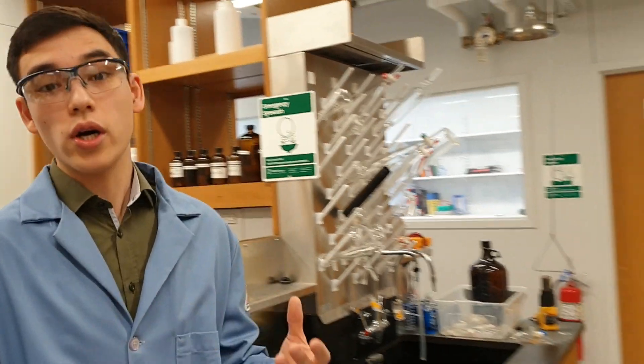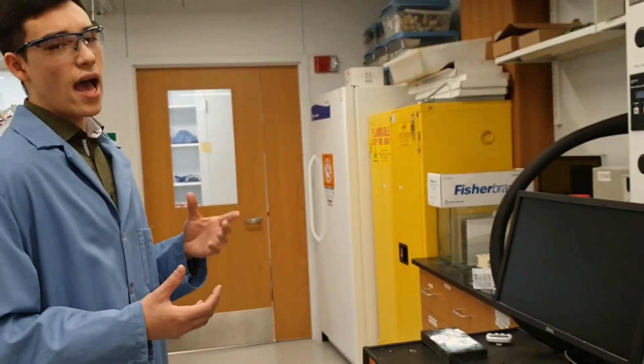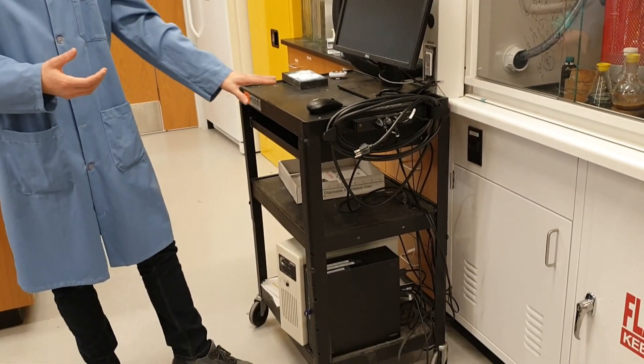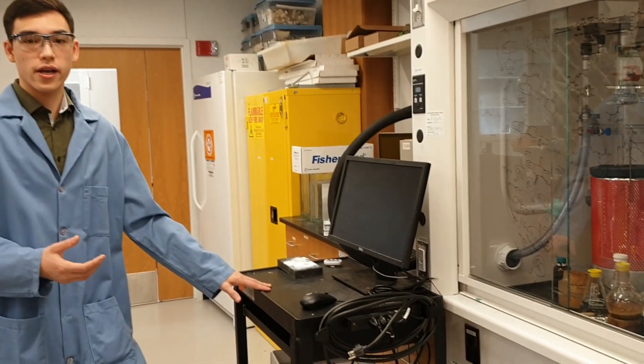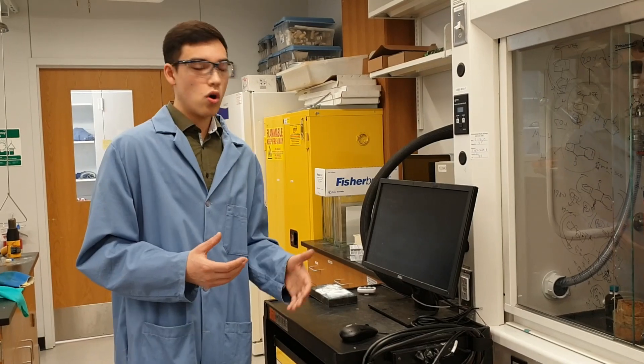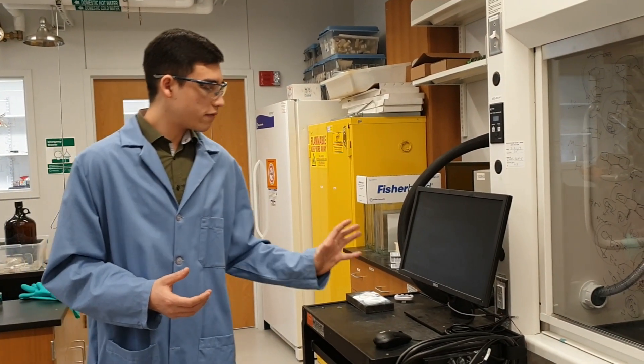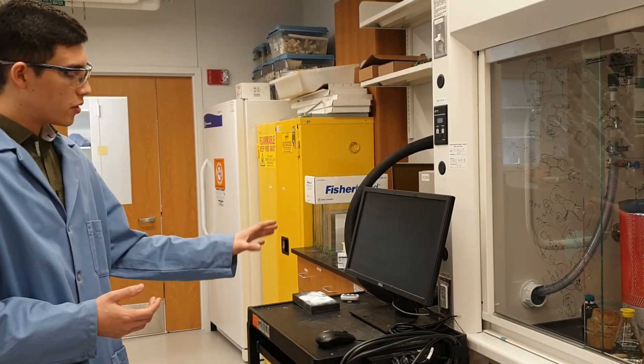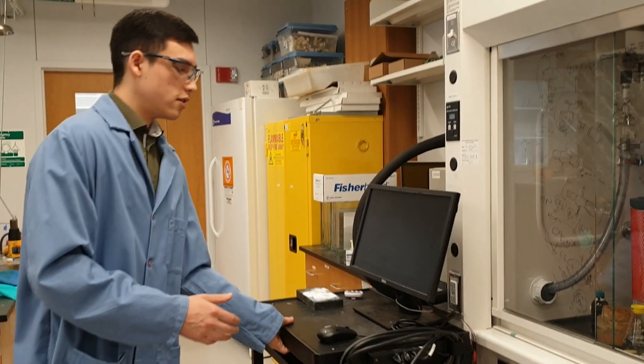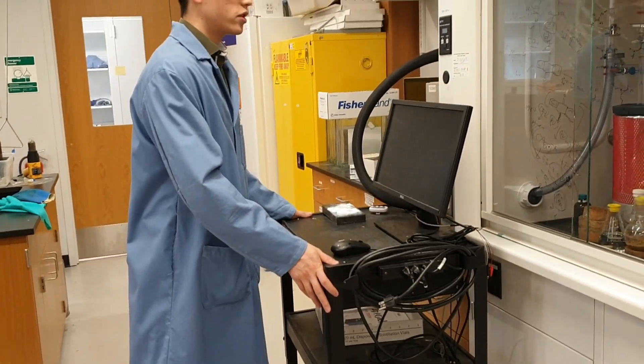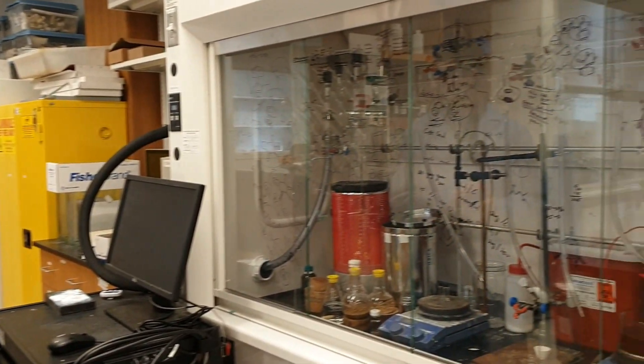I want to show you another piece of equipment which is stored in this area. Our lab, as an electrochemistry lab, has two potentiostats. The potentiostats are used for recording CVs or for doing controlled potential electrolysis. They're really convenient to use and connected to a computer, which is also just confined to this unit, which you can mobilely roll around to your own fume hood.